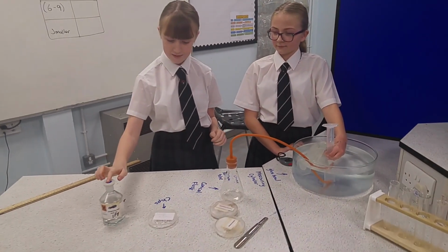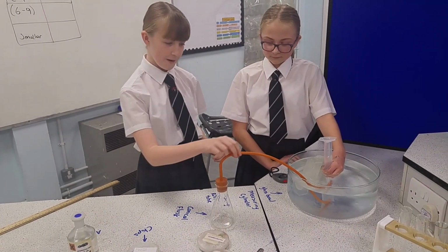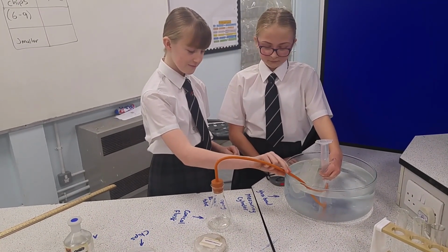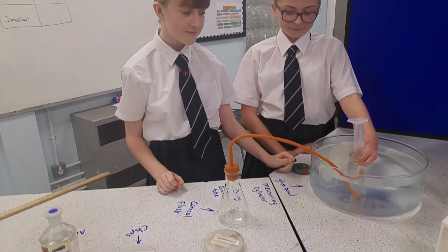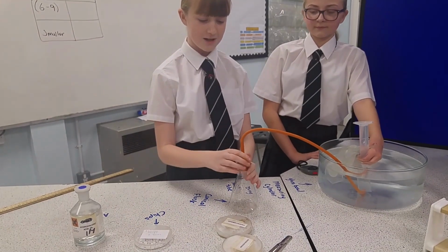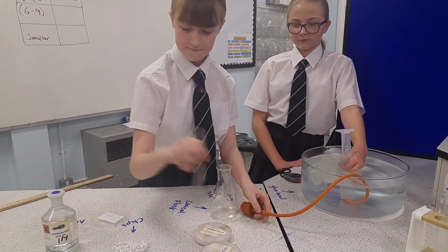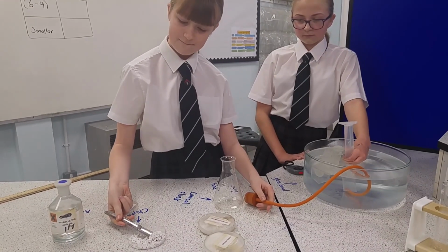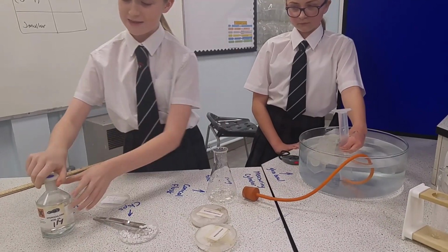Here I have an acid, the marble chips, a conical flask, a bung attached with a rubber tube, a glass bowl and a measuring cylinder filled with water. We're going to place the marble chip into the conical flask. And then we're going to add the acid.